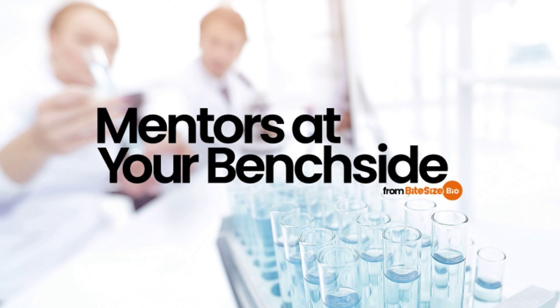Denatured ethanol, either 95 or absolute, contains additives such as methanol or isopropanol that render it unsafe to drink and therefore exempt from certain beverage taxes. This makes it cheaper than pure ethanol. Of all the ethanol grades, this is the one you're most likely to use for disinfection in your lab.